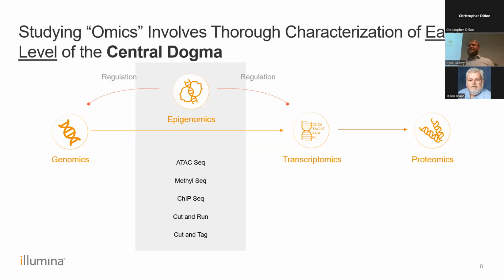The next thing is ATAC-seq, and this may be a little less familiar to all. This is the assay for transposase-accessible chromatin. What this uses is a transposase. We put that into our nuclei, and what it's going to do is chop up areas that aren't chromatin-bound DNA. It's going to be like a counting assay, so we're just going to look at the areas that are open. And what that's going to tell us is we can look at either transcription factor binding sites, or we can look at promoter and enhancer regions to give us an idea, again, of what might be happening transcriptionally, or what's causing the transcriptional sequencing that we are seeing if we're doing a multi-omic type approach.